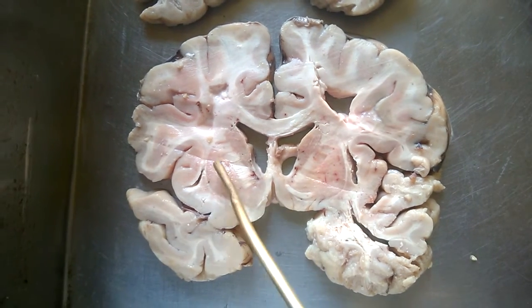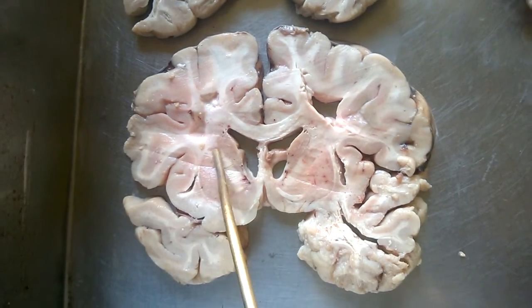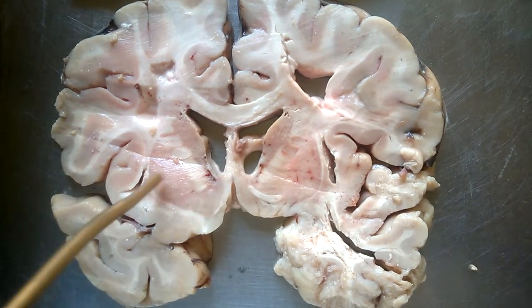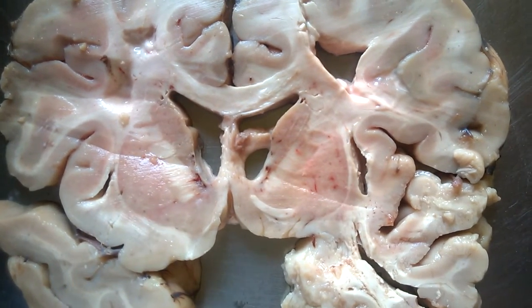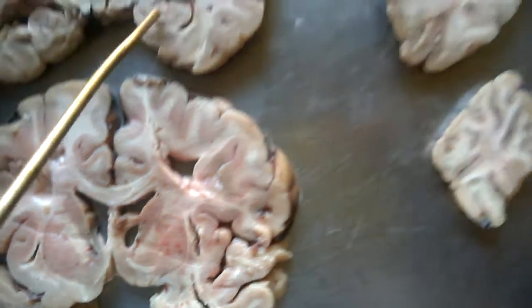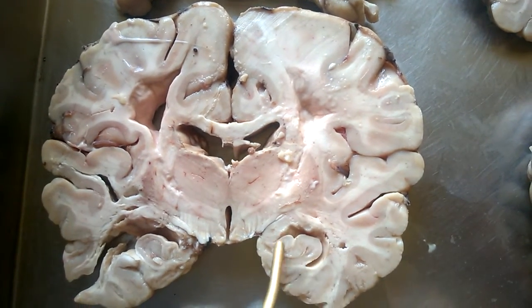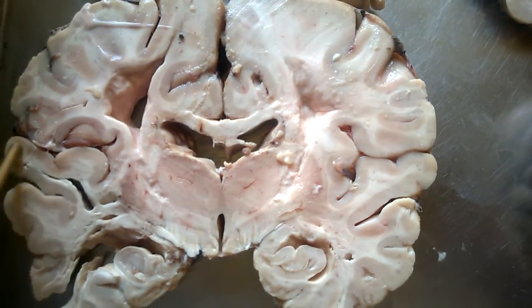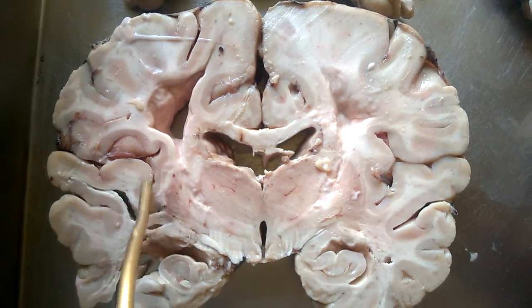putamen, and together the caudate nucleus and putamen are called the striatum. That is because the internal capsule here gives a striated look. The fibers look striated here, so together they are called the striatum. Then here we can see the hippocampus. This is the hippocampus. This is the insula. The insula is the part of the cerebral cortex that dips deep into the brain matter.